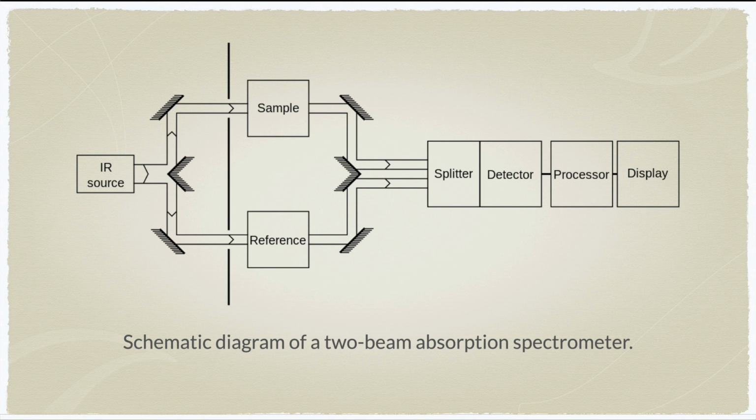You have to transform that, so you'll get a kind of raw data. From the raw data you transform into the different frequencies. So from the whole frequency you transform it into different sets of frequency, and then you can plot the graph. This will be faster. It will take just minutes.